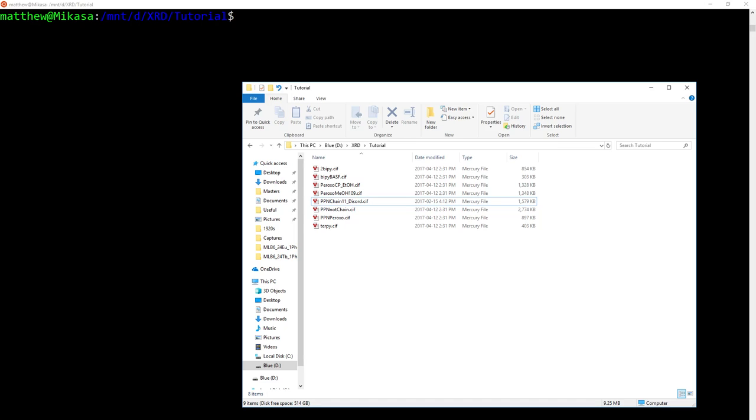So I'm going to show you how to do this in the DOS/Windows command line, command.exe. This would in theory work on any DOS system going back a very long way. I will then use the Linux subsystem for Windows to show you how to do the equivalent on Linux. And then I will show you why not to do this in PowerShell and why I don't use PowerShell. But in case for some reason you had to do this on PowerShell, you'll at least see the command so you can figure out the rest.